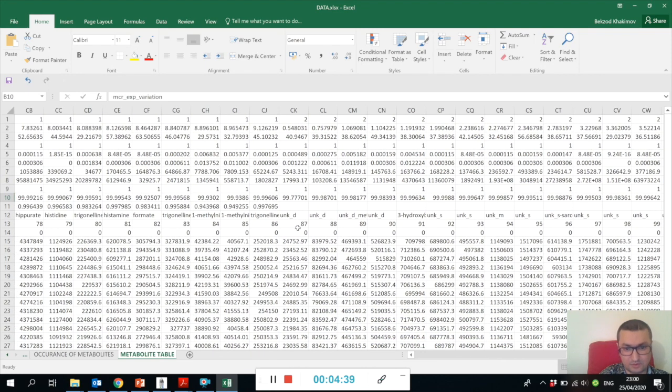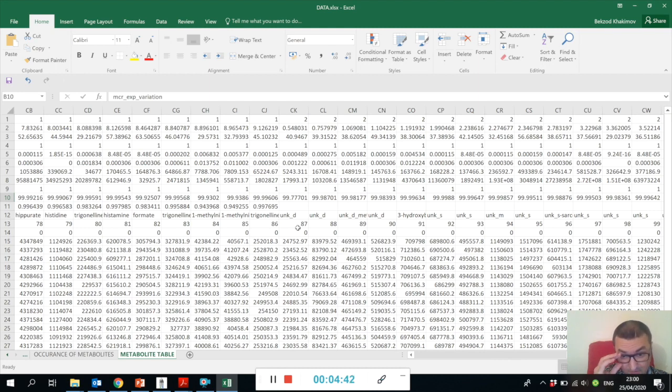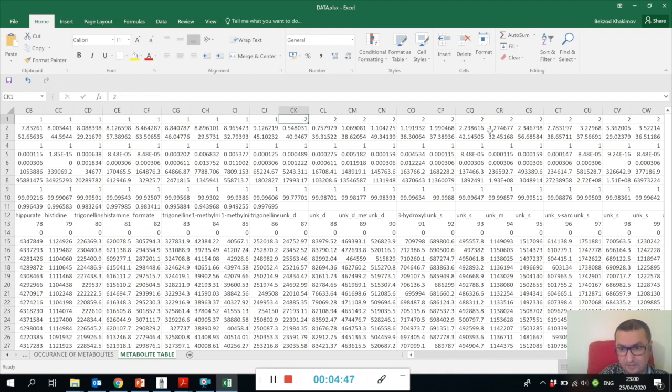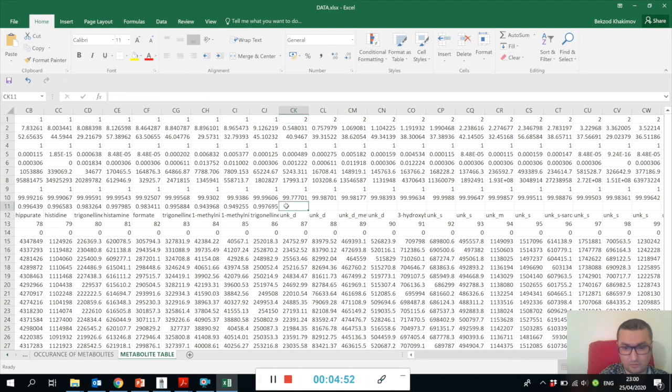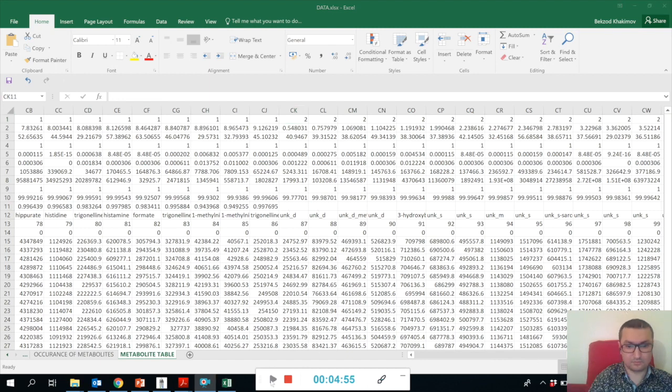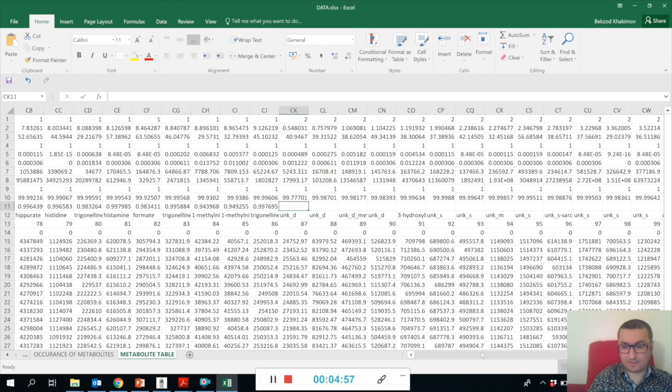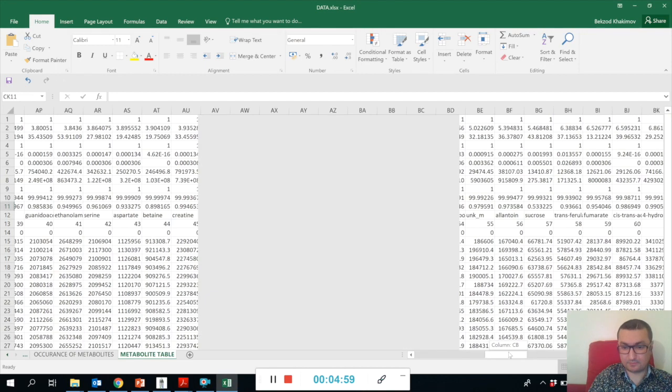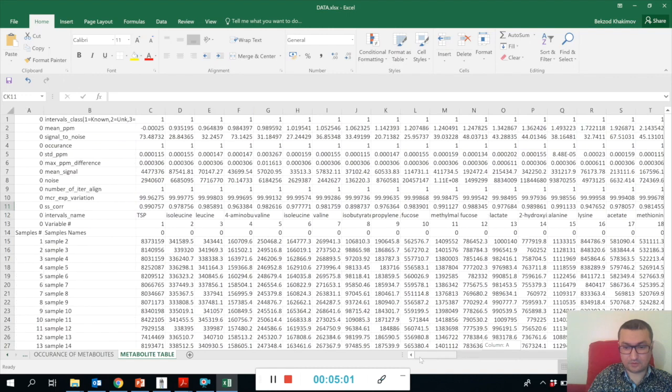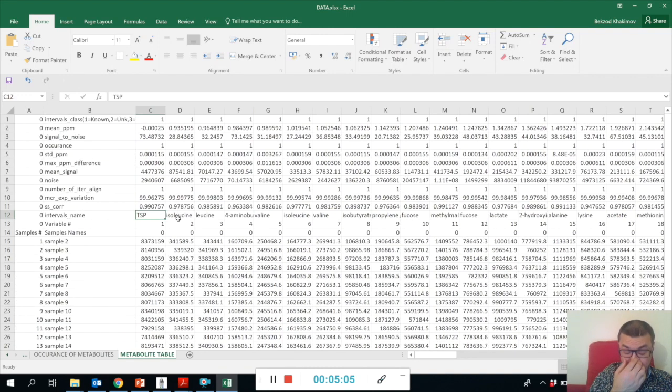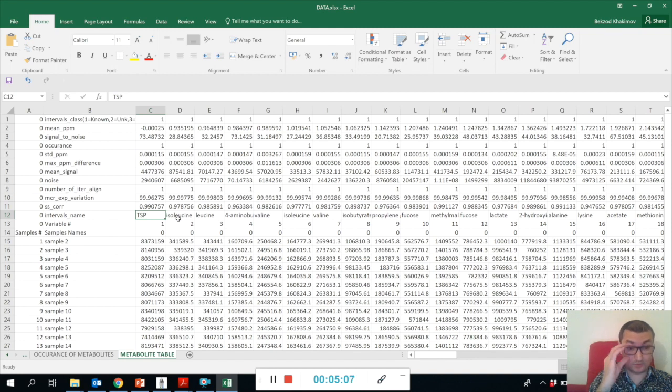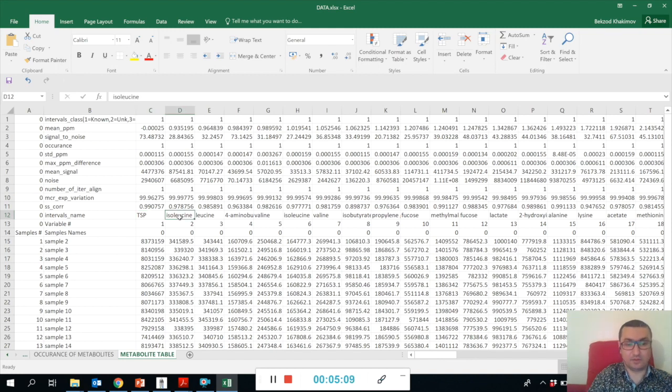As we start with unknowns and bins, we don't use MCR anymore. This was the metabolite table. Here you have also the names of each of these signature signals. We actually included the TSP and all the other metabolites.